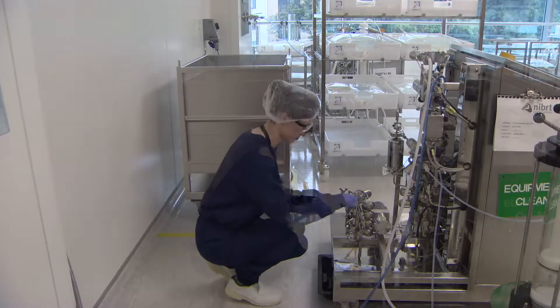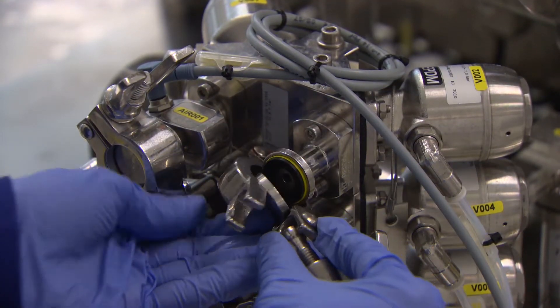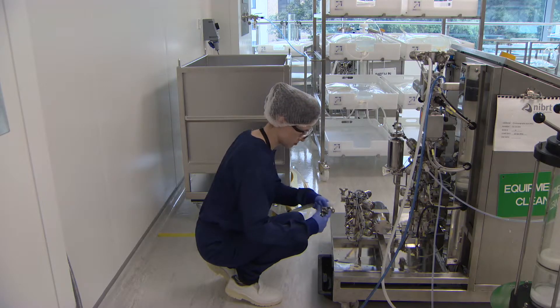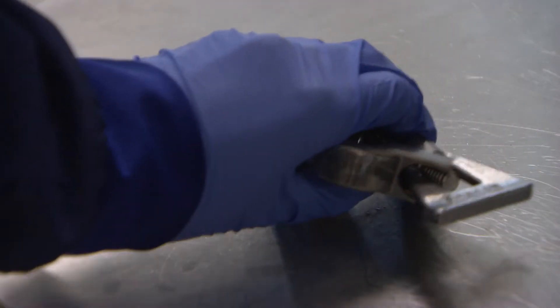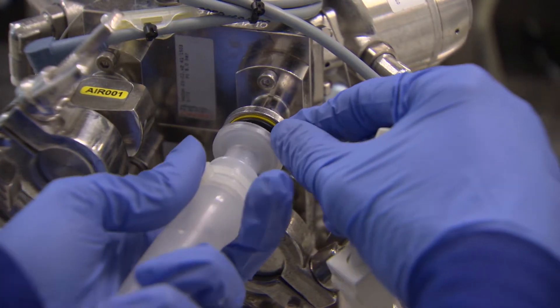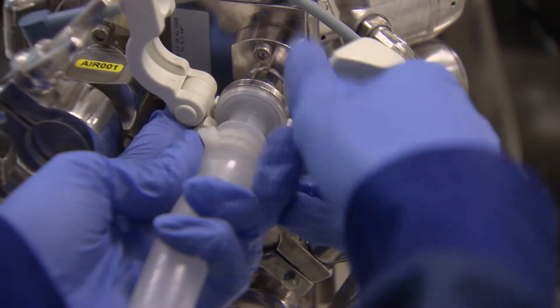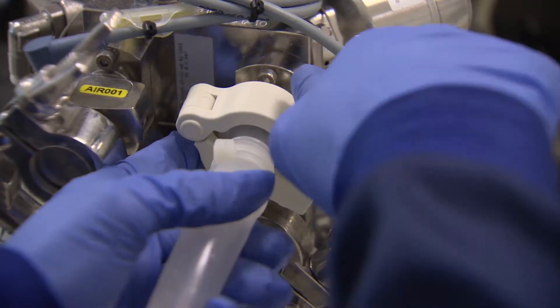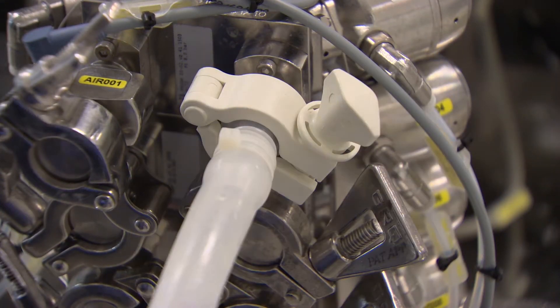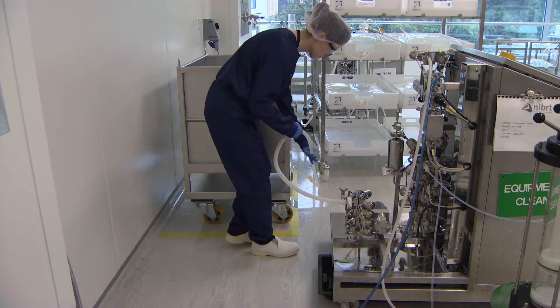The first process step is to connect purified water or buffer in order to prime the chromatography column. A hose from the tote is connected at the rear of the system. The operator removes the stainless steel clamp and blank from the inlet connection on the chromatography skid. The plastic hose connection from the supply is sanitized and attached to the rear of the skid using a plastic tri-clamp. The line is then checked to ensure a proper flow path has been established and any additional clamps on the line are open.